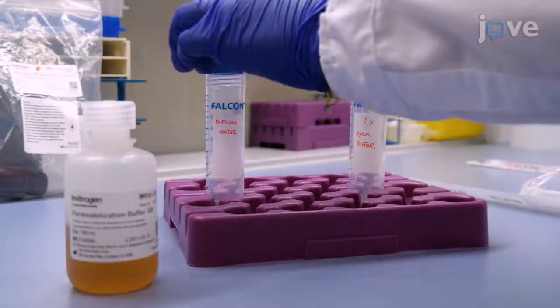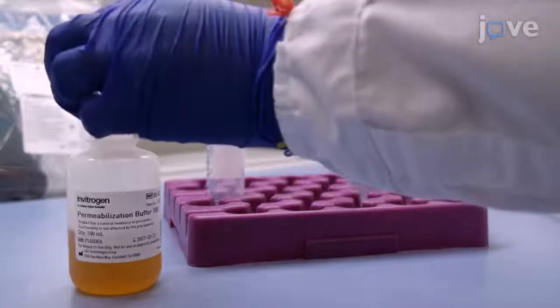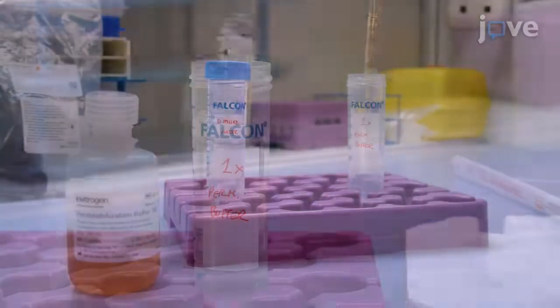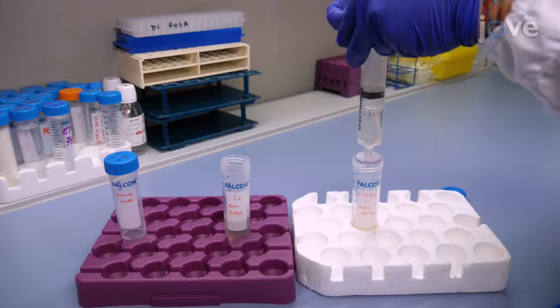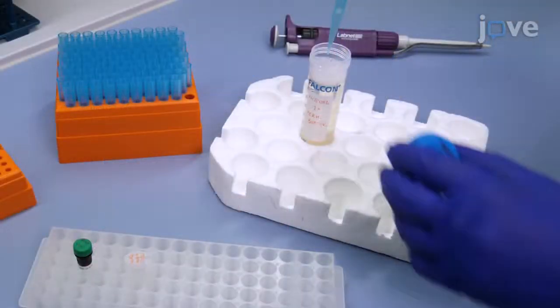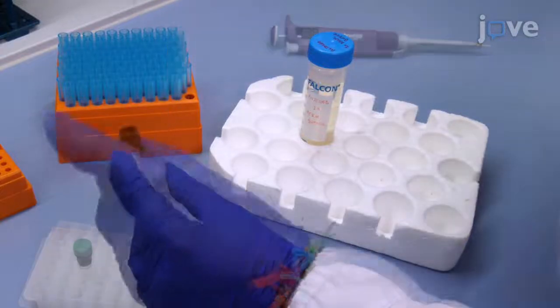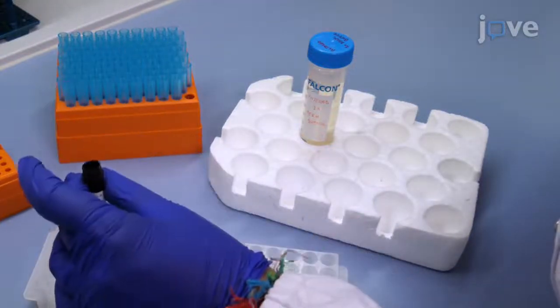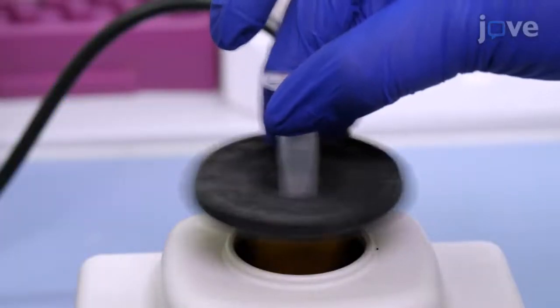Prepare fresh 1x permeabilization wash buffer by diluting 10x permeabilization buffer with distilled water and filter it through a 0.45 micrometer filter to eliminate aggregates. Dilute monoclonal antibody Ki-67 FITC in 1x permeabilization wash buffer as determined with a titration experiment for a final volume of 100 microliters per sample.